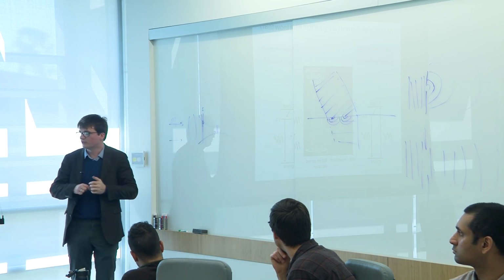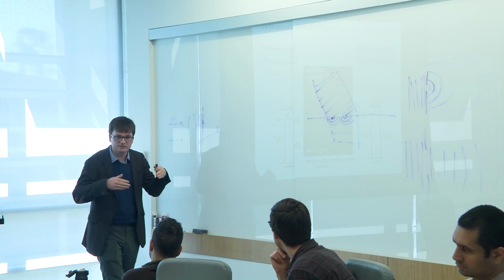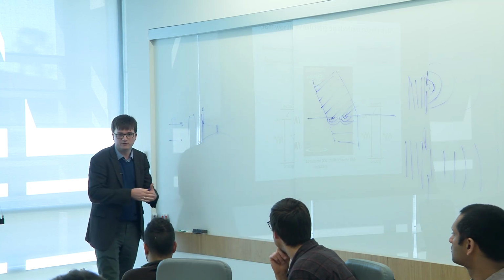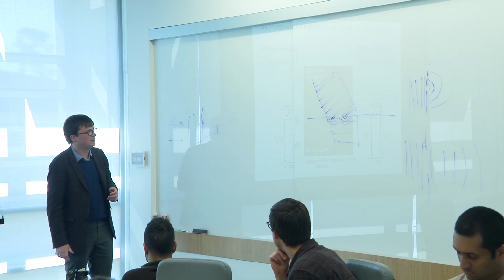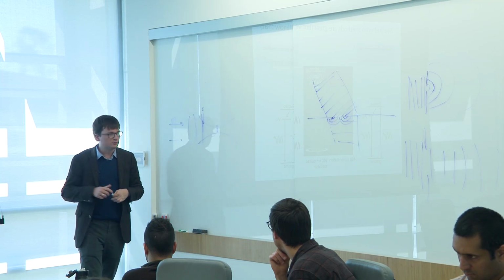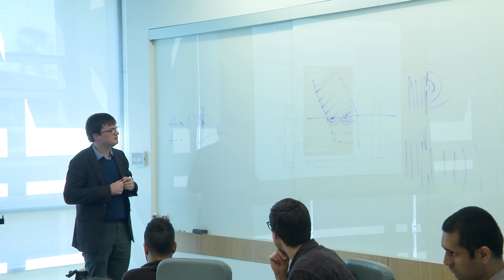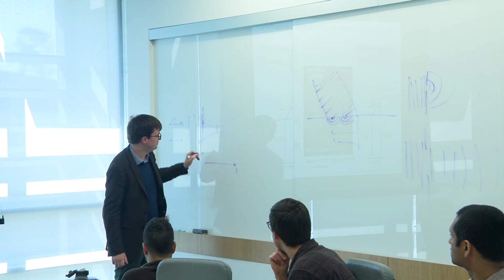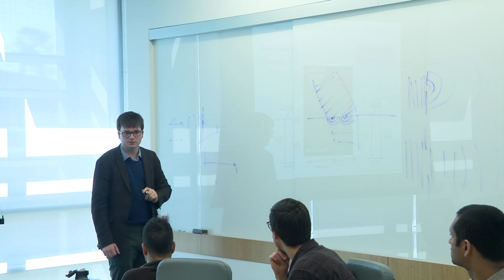And so as you go in brain tissue, for instance, the wave intensity is going to decrease significantly, and you're going to have an emission of photons that's happening along the way that is not necessarily centered there. When you go to a 2-photon process, what matters now is the square of the intensity. So if you look at the intensity as a function of z, for a 1-photon process, you get that.